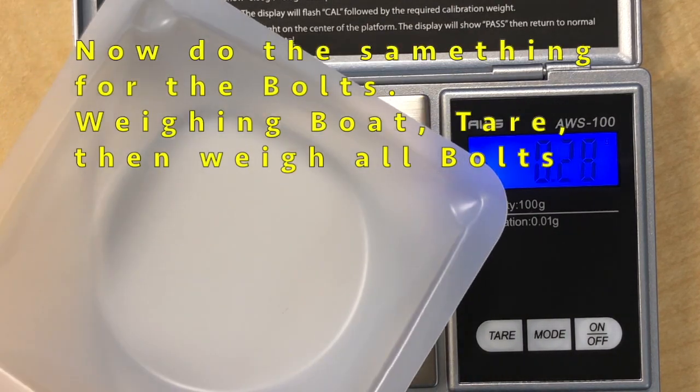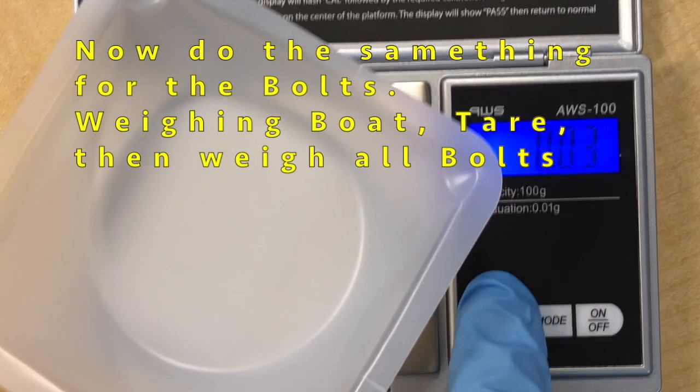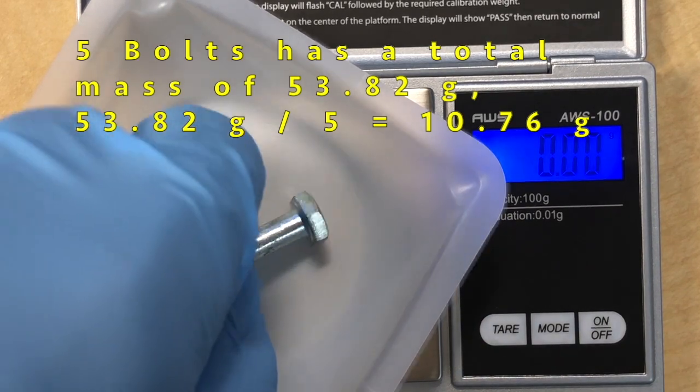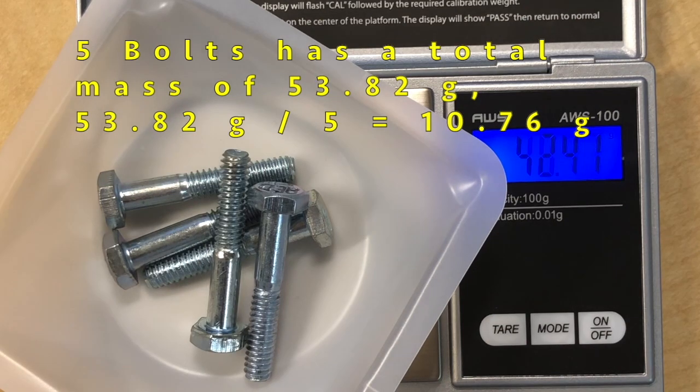The next thing we will do is place the weighing boat again on the scale. Make sure you tare it so it reads zero, then put all your bolts on. Here we have five bolts and the mass of the five bolts is 53.82 grams. So 53.82 divided by 5 comes out to 10.764 grams per bolt.